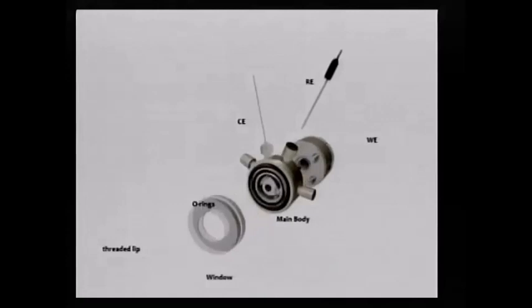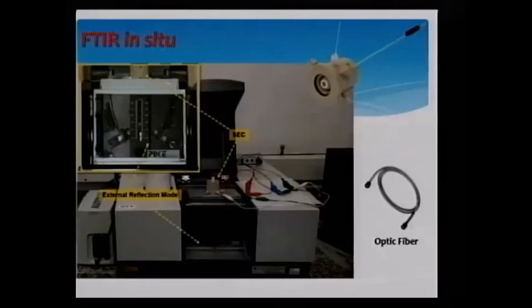Well, this is the FTIR. I will go fast here. I don't want to talk about technical stuff, you know. But this is a conventional FTIR. You have one here. This is our cell. So we have the FTIR beam. It will interact with the mirrors, and the beam will be guided to the surface of the cell. It will hit the electrode, be reflected, interact with the mirrors, and go to the detector. Here we have the potentiostat. So we do electrochemistry, and we take FTIR spectra at the same time. So what you see are the bands of the reactant that are going out, and new bands appearing due to the generation of intermediate products.